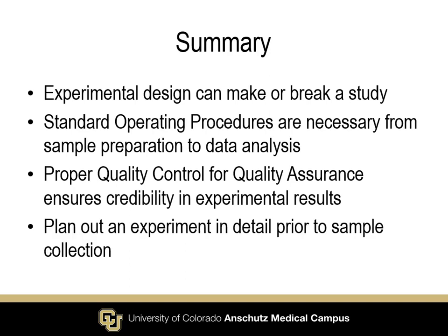And then you want to plan out an experiment in detail before sample collection so that you're preparing for any potential issues that might arise, like tubes or people that can't complete their extractions. And lastly, of course, you want to document everything. Lab notebooks, OneNote, whatever you do, document it all.